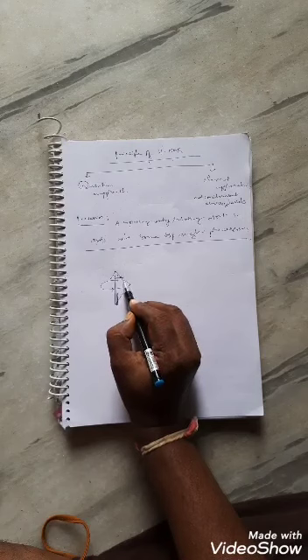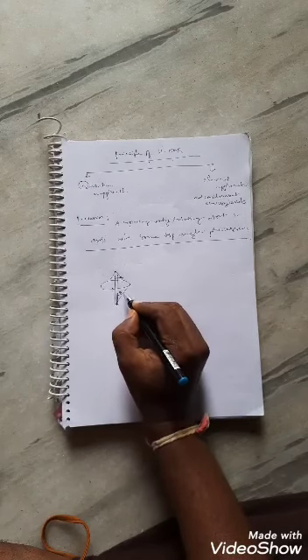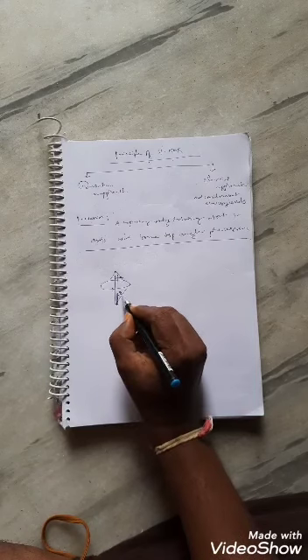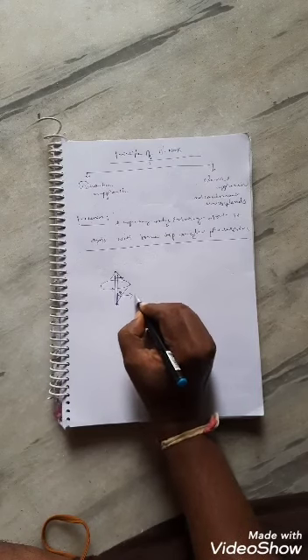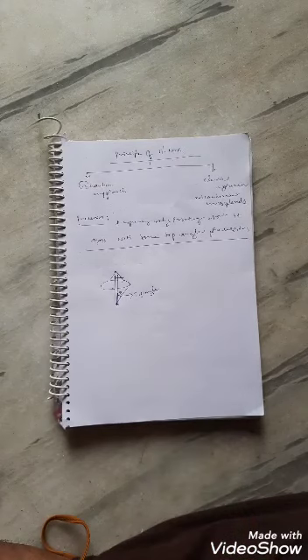So with an angle of theta with respect to its axis, this angle is called the tip angle, right?